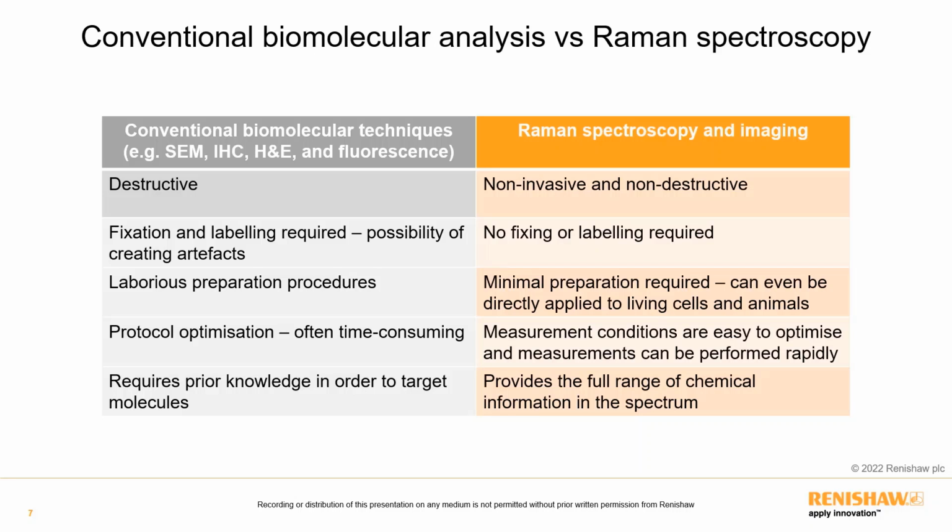Ultimately, the fact that Raman provides you with a full chemical fingerprint of the sample, allowing for identification of particular constituents and biomolecules, and its ability to do this in a non-invasive, non-destructive, label-free way really does make Raman an excellent tool for analysis of biological samples.